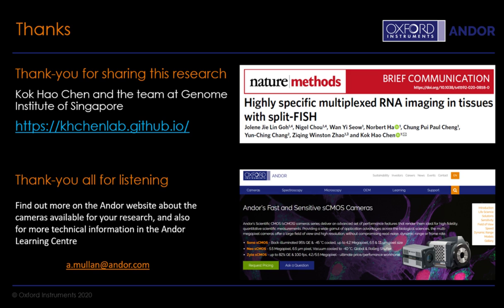That's a very nice question. I think this is certainly a goal. For now, we are using the standard wide field microscope to do this imaging, so very thick sections will be challenging to focus deeper.